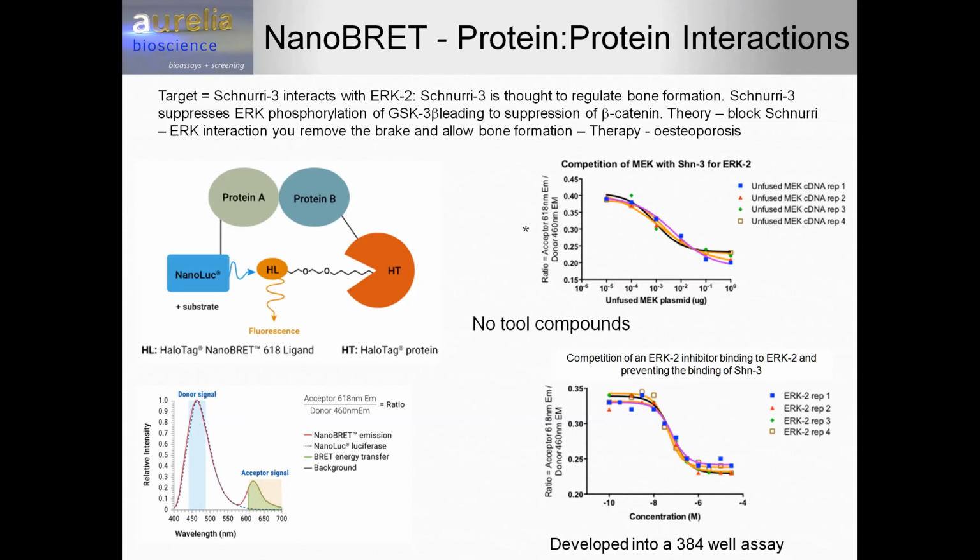On the other protein, you would put a protein which becomes a HaloTag when you add the fluorescent ligand. When the fluorescent ligand is added, it binds to this HaloTag protein. And then effectively you have protein A manufacturing photons because it's got the luminescent enzyme at the end, and protein B is in a position to accept those photons, having a fluorescent ligand.